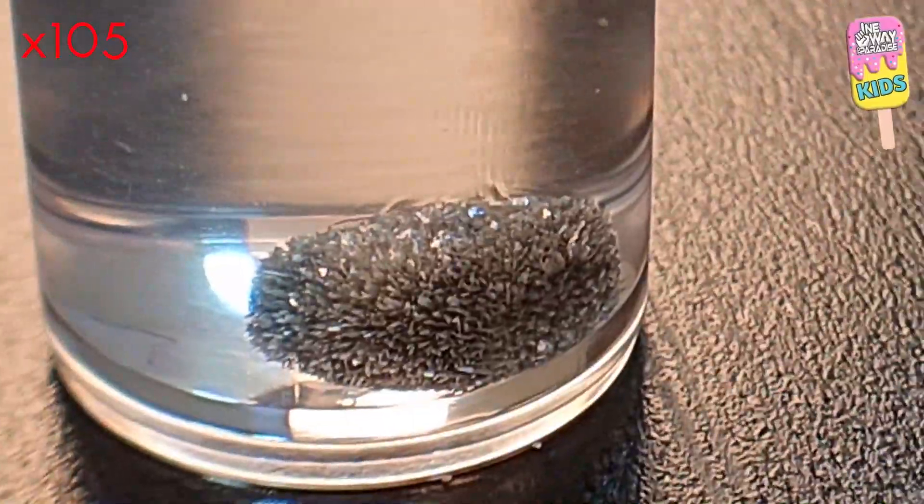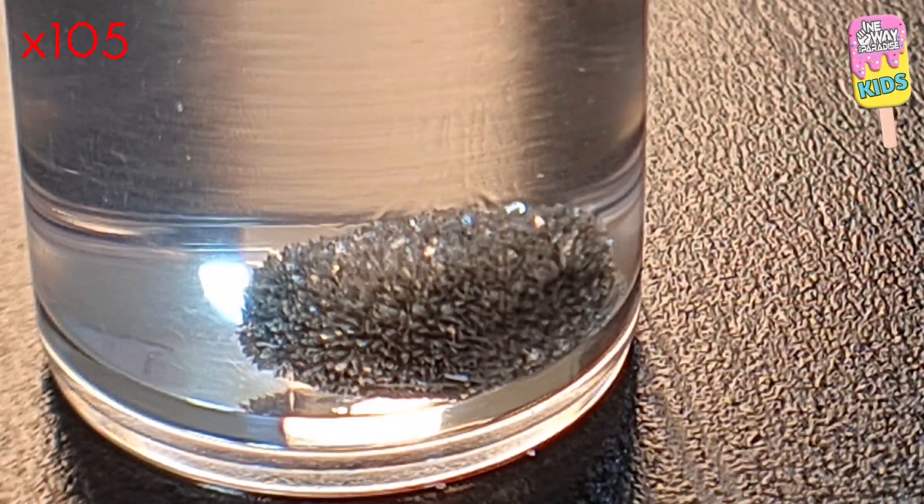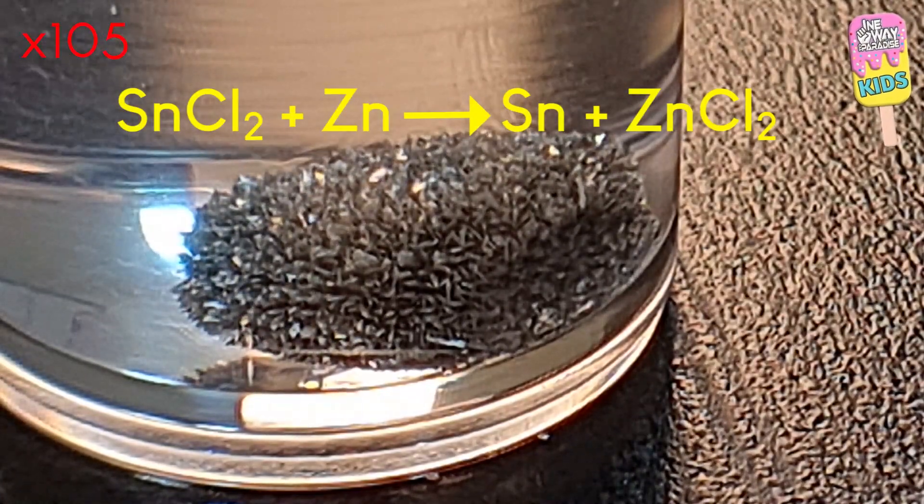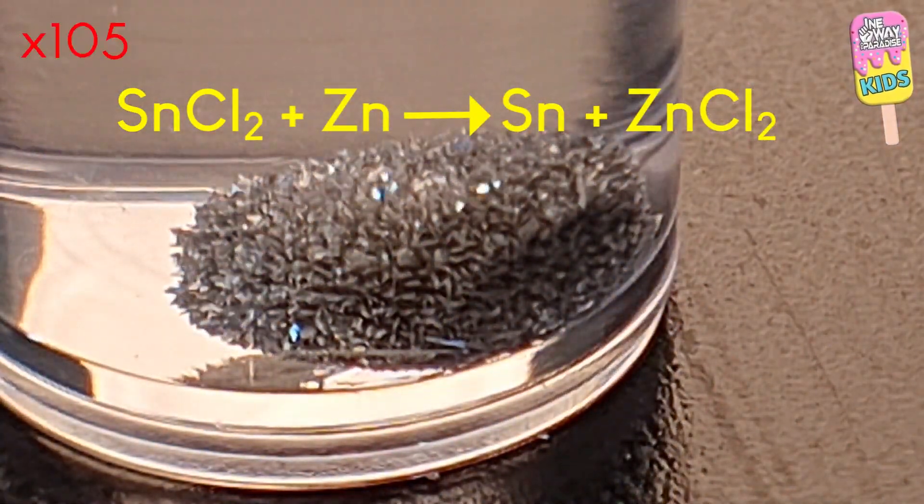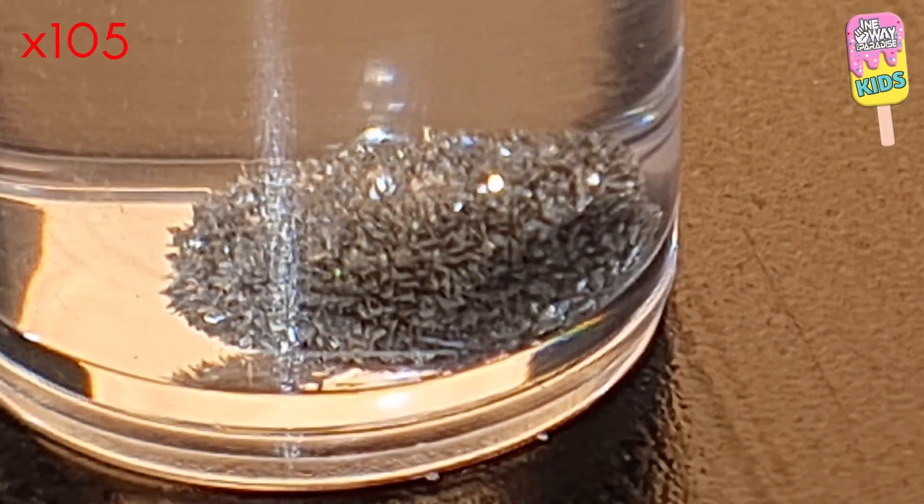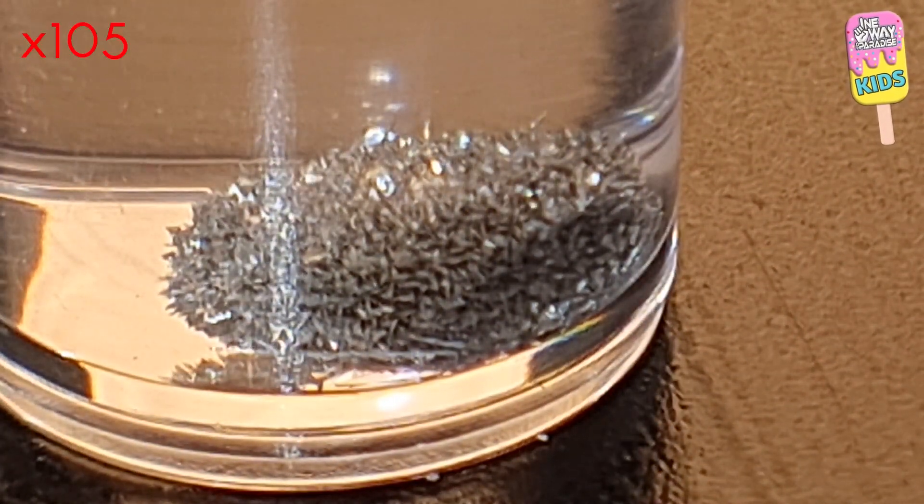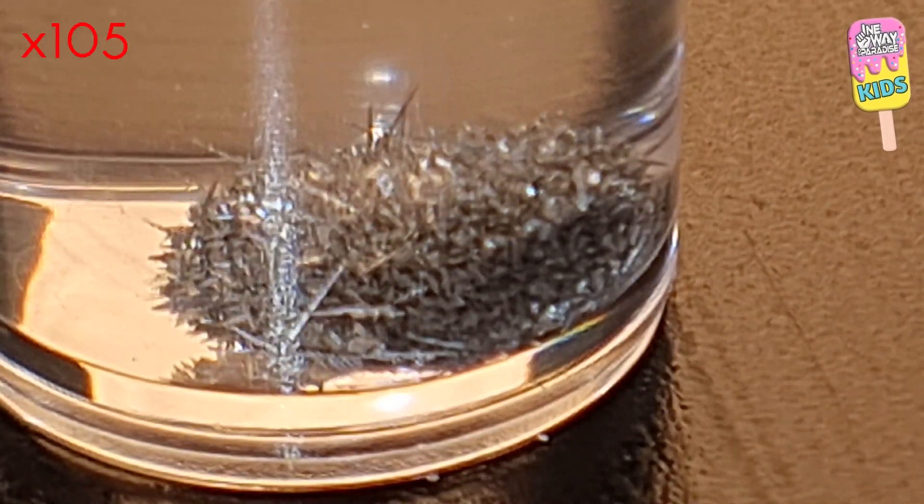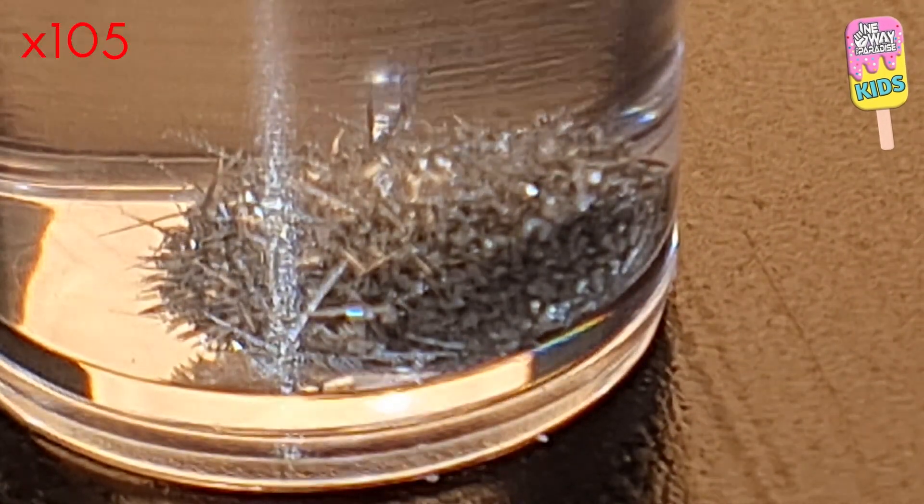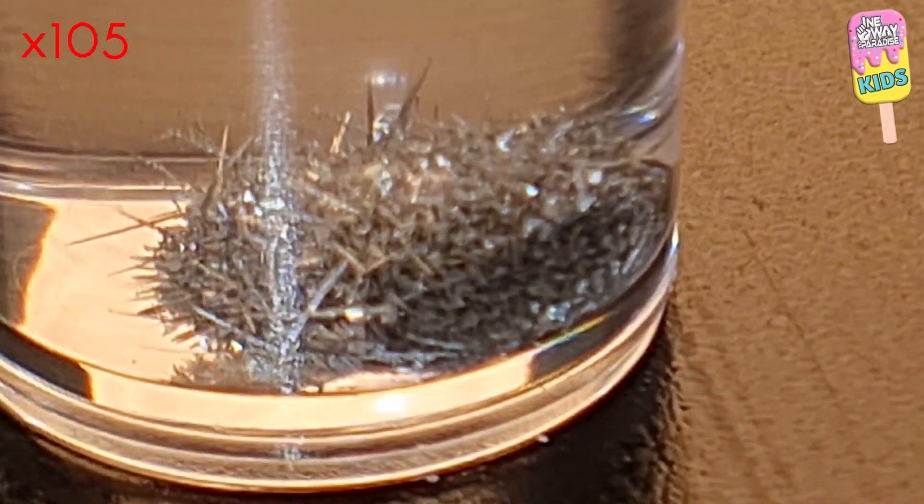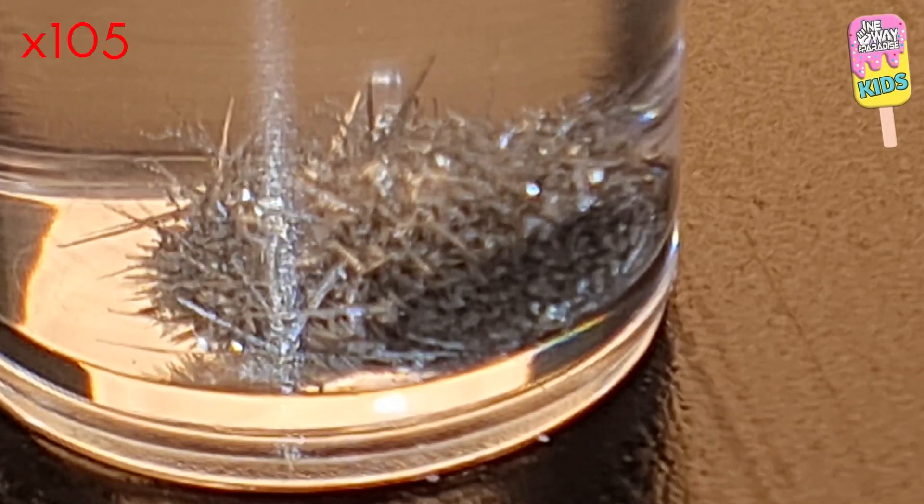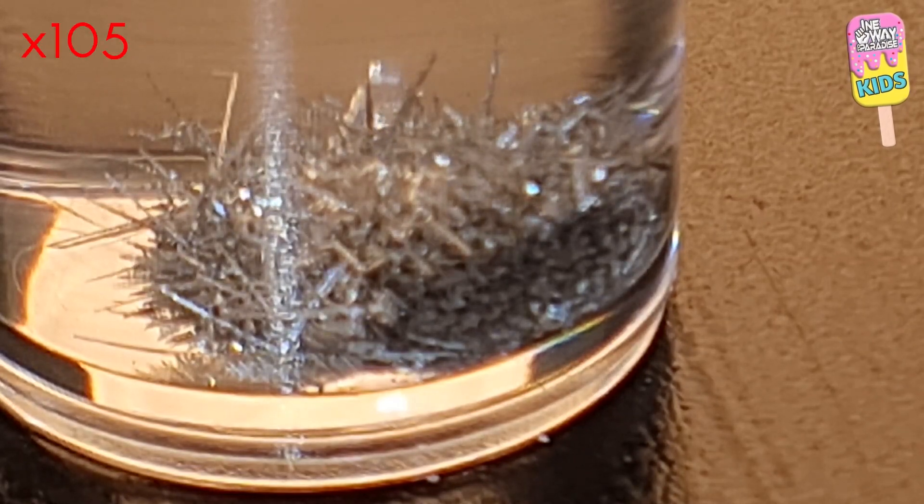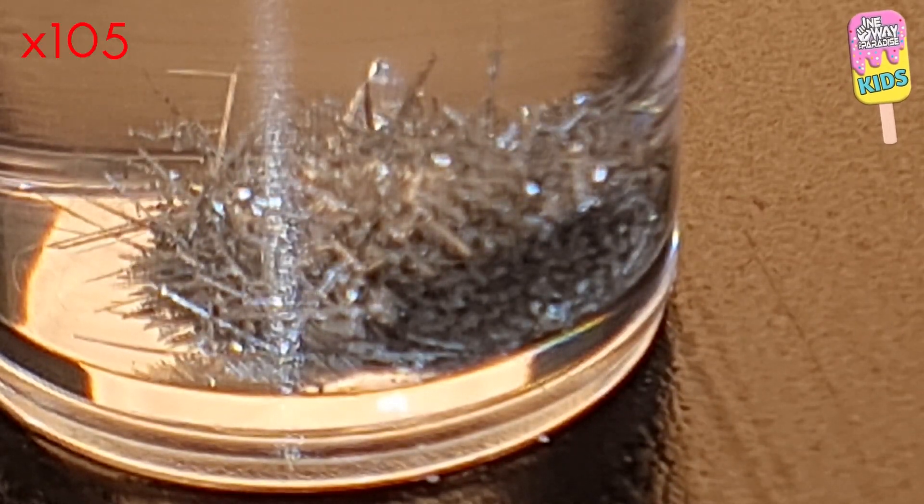When zinc is added to the tin chloride solution, the zinc pellet reacts with the tin chloride and the following reaction occurs. This is an example of a single displacement reaction. Zinc acts as a reducing agent, giving electrons to the tin chloride so that the tin precipitates, as in substances in it become solid and separate from the liquid or solution. The reaction begins at the surface of the zinc pellet and the tin precipitates or forms into solid from the solution as beautiful crystals in a process called crystallization.